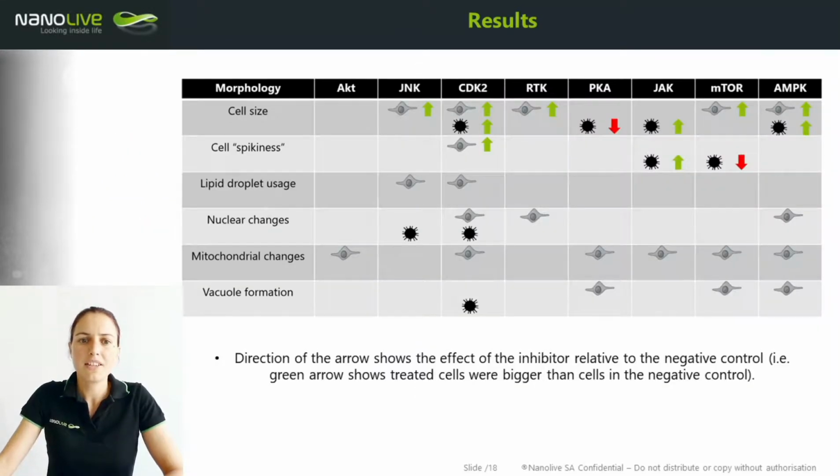This table gives you an idea of the type of novel information that can be assembled from CXA screens. Here I went through every individual video and analysed the changes in cell morphology that occurred in response to each drug. I did this for both pre-adipocyte cells and cancer cells, and then created this table to compare the phenotypic responses of the different cell types.